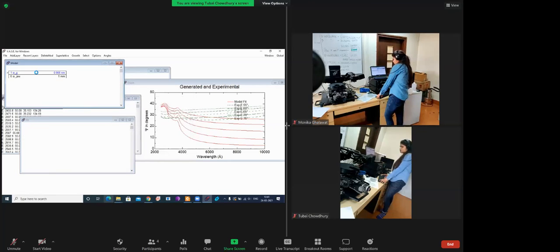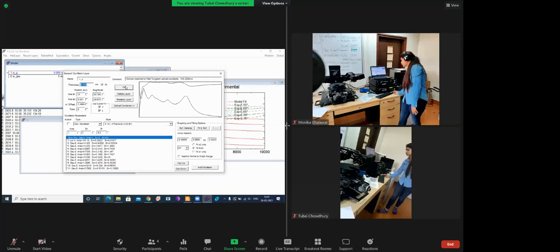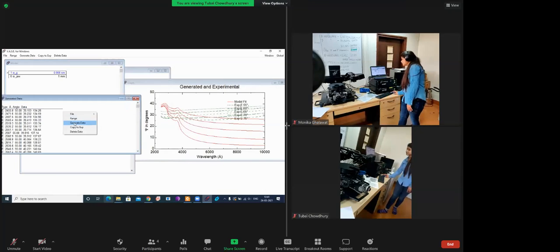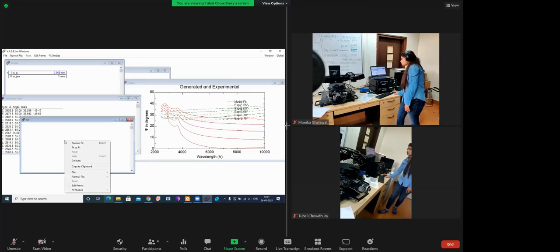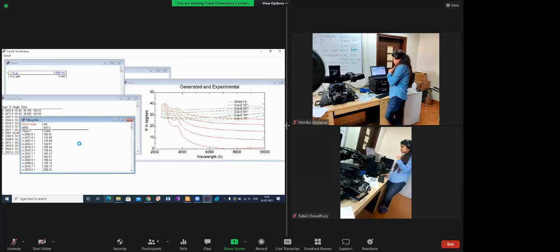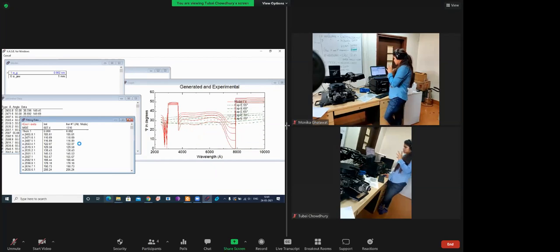This is not the proper way of doing this fitting, because this will give me the information about tungsten, fine, but there is always a silicon dioxide layer. It will not give me the information of that silicon dioxide. So if you have your reference material, please always add that layer in between these two. Still it's not matching, because the layer is there.